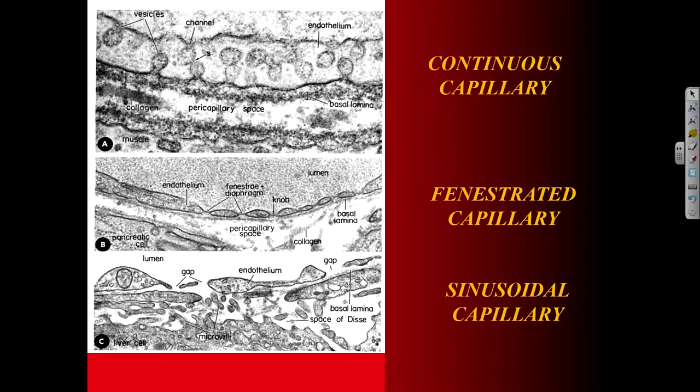The diaphragm is a membrane. So the fenestration is the hole, and across that hole is a membrane which we call the diaphragm. It's a membrane that covers the hole. So no cell is going to pass through there. It's only fluids and very small molecules. Nothing is going to get through there easily. It spans the hole. You can see it here. It goes from one end of the epithelium to the other. That's the diaphragm right there. Here's another one right there. It's basically a little bit thinner than a plasma membrane. It's almost like a plasma membrane covers that hole. Very thin sheet. Okay, another question?